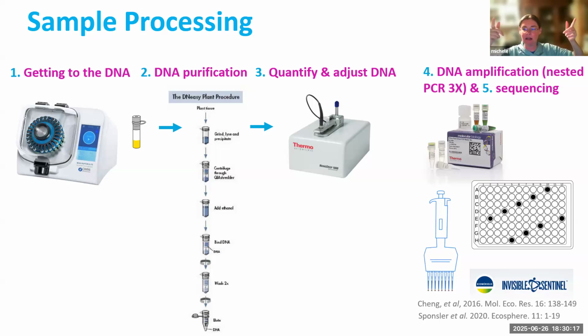The second round, you're amplifying again, but you're actually adding little molecular tags to that DNA that tell my sequencing facility, when they run their reaction, yes, this is good DNA. This is part of the whole group that needs to get sequenced. The last part, and this is what makes it metabarcoding, the last round of photocopying literally takes a tiny six base pair piece of DNA and incorporates that into that fragment, so I know what sample that DNA belonged to. It tells me that this sample belonged to whoever's name that sample reaction was. So when they go back and assemble it at the end, I know that that was whatever sample so-and-so sent me.